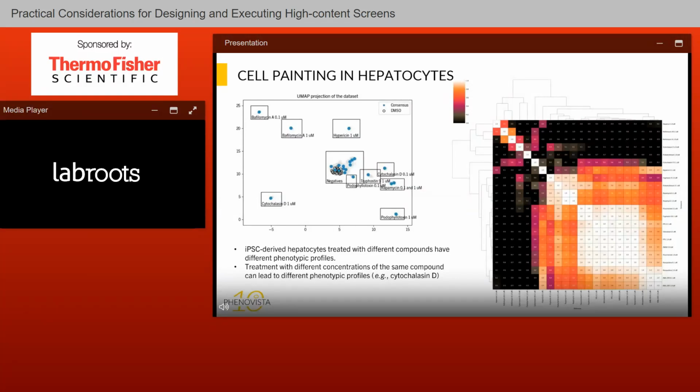And then another approach, you can use one of these dendrogram type plots here to do a kind of a ranking. So you can then rank compounds and put the similar compounds together. It's essentially a similar approach, but gives you two different views, and people have their preferences. But there's hundreds of different ways to mine through this data.